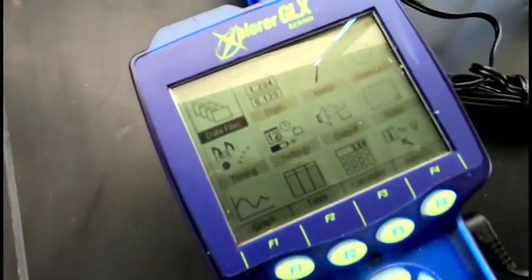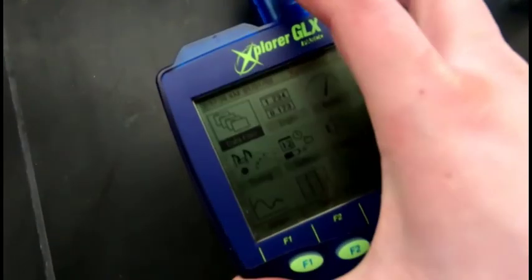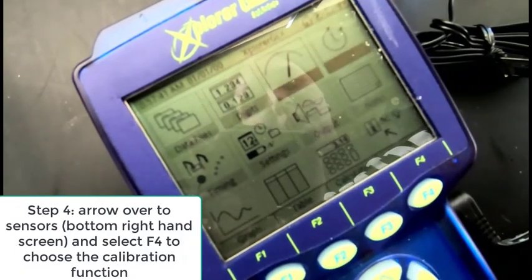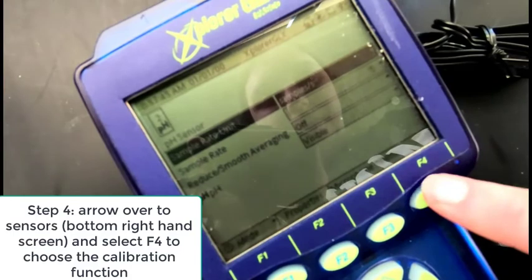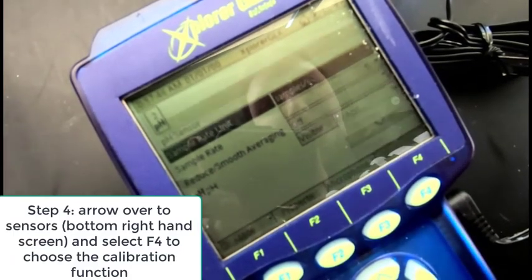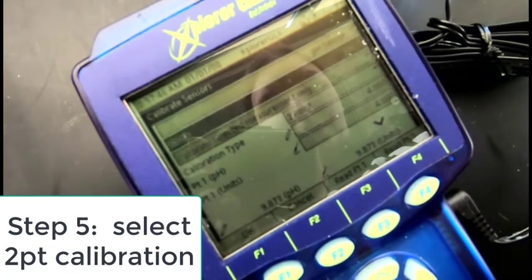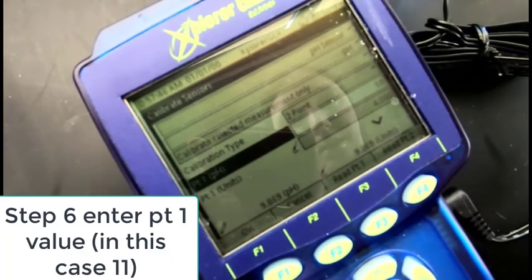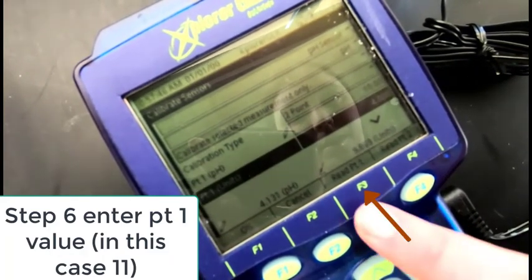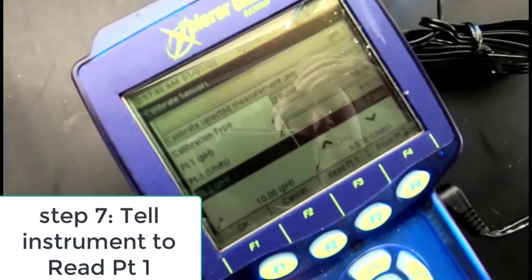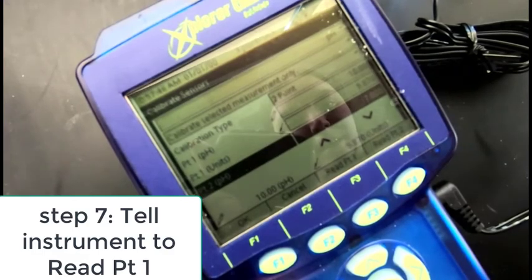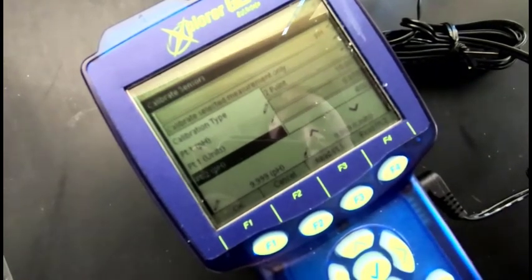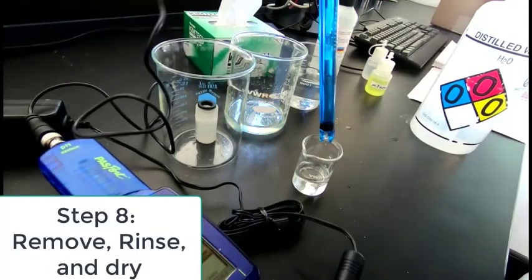And then we're going to zoom in on the GLX. So first off, if you look in the bottom right-hand corner, that's sensors. So you can arrow over and then we drop down with F4 and select calibrate. And what we're going to do is a two-point calibration. And so now she's setting that first point at 11.00. And then it's reading. And when she pushes read F3, what that does is it says register the voltage right now and call that 11.00.